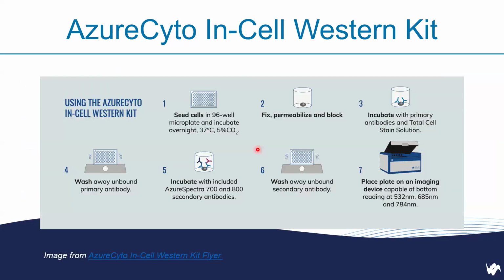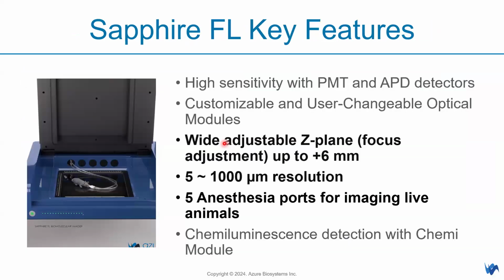Okay. And then here's a protocol on how to do it. It's just the basics of fixing, incubate, wash, and incubate secondary, wash. That's it. All right. Okay, moving on.